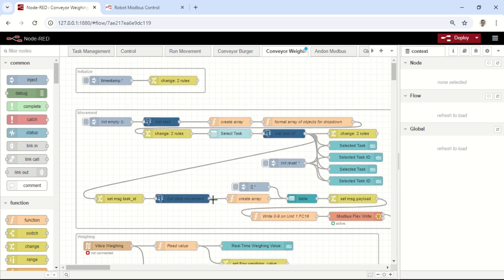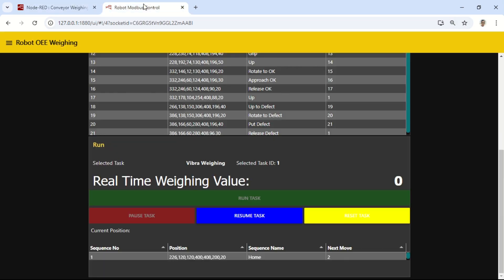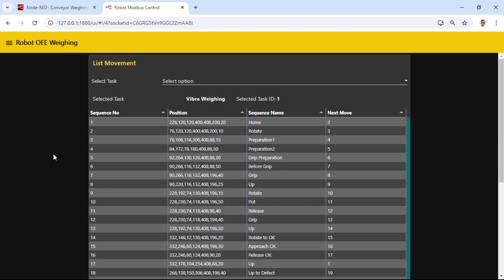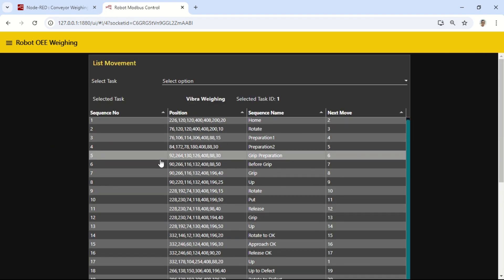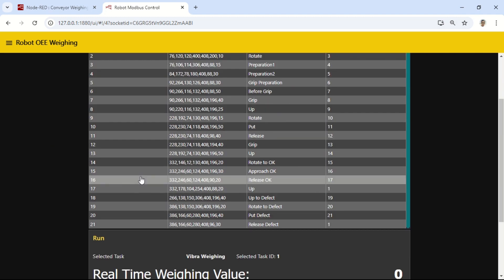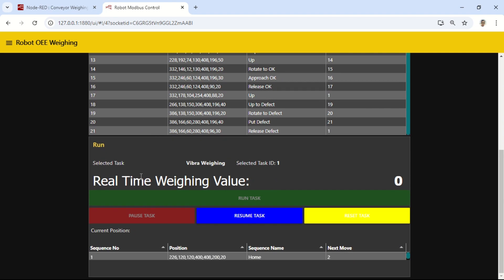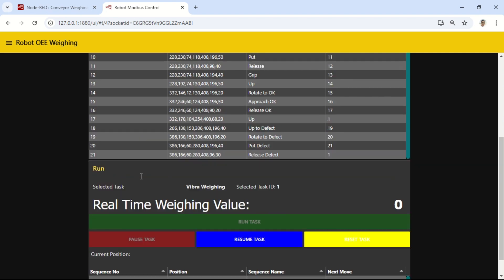There are a few modifications, such as adding the reading of the analytical balance via serial, and using a switch node to sort the movements based on whether the weight reading matches the criteria or not.